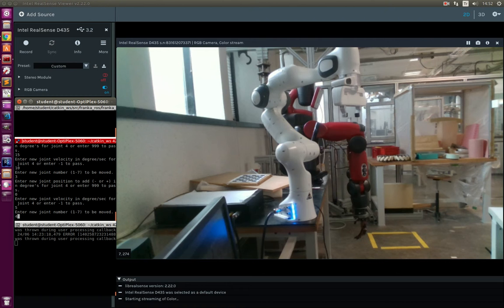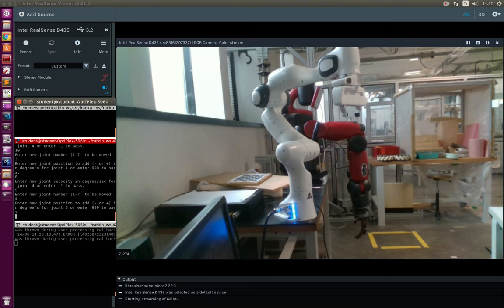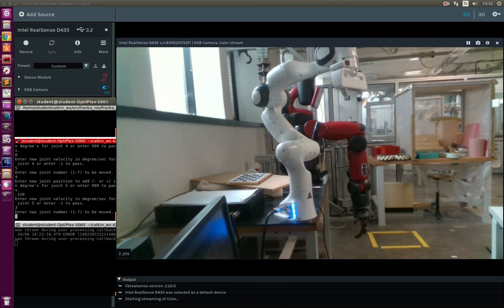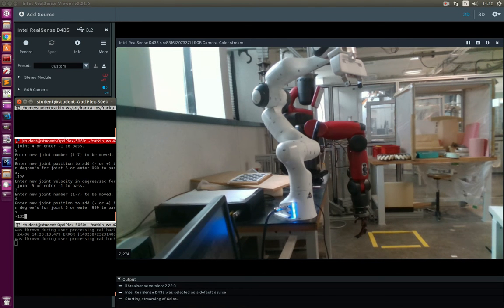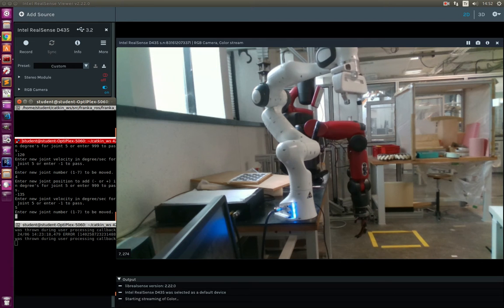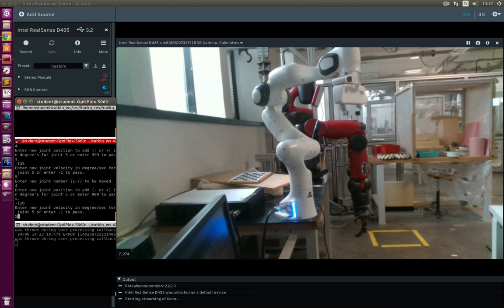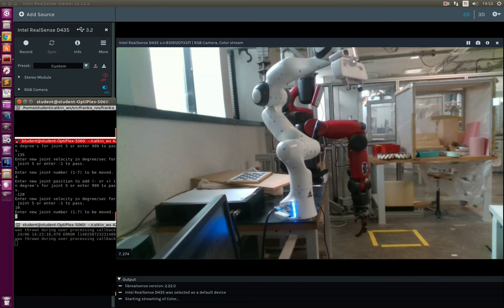The fourth joint is at minus 135 degrees. I am sending it back to minus 120 degrees with 3 degrees per second — not much problem. Sending back to minus 135 degrees with 5 degrees per second — very little oscillation, you may hear the sound. Sending to minus 120 degrees with 10 degrees per second — as you can see it started oscillating. It is small but it will be a problem. Sending to the original position.